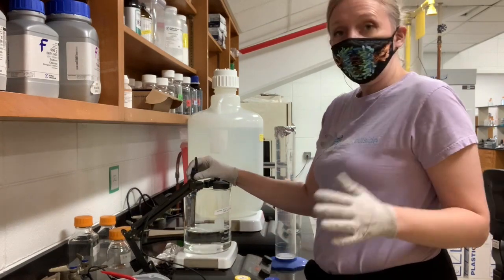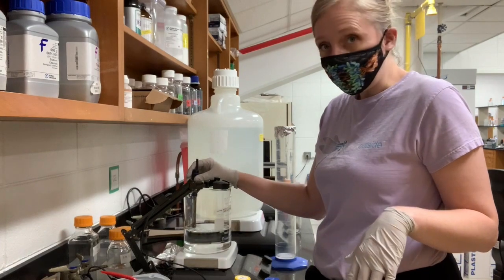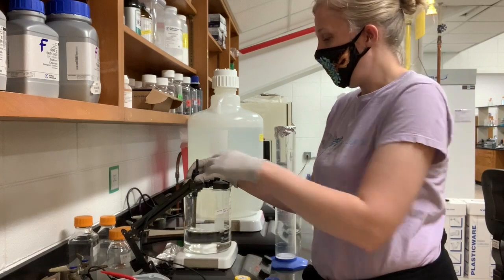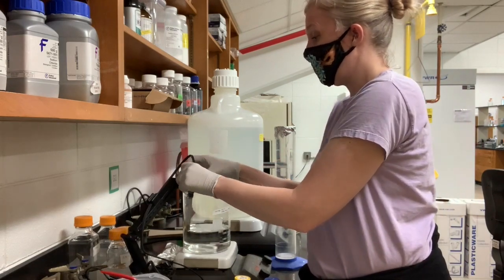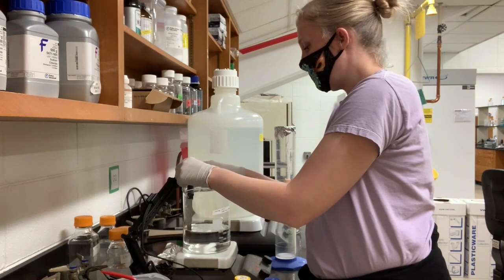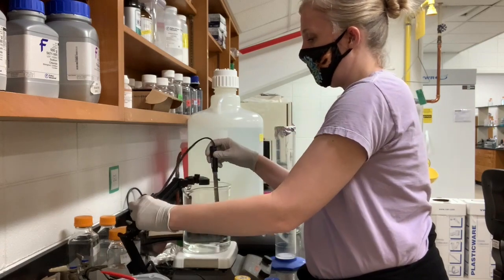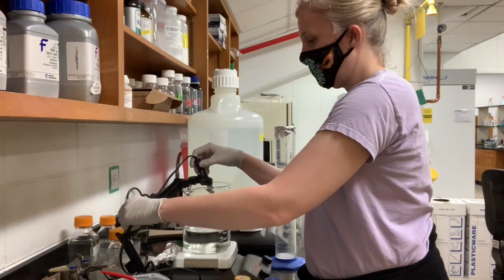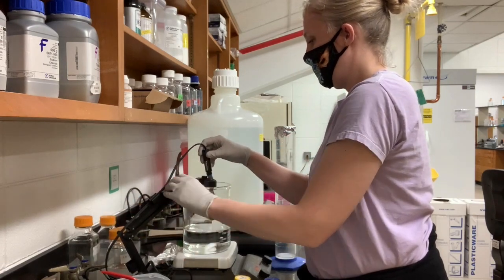You want the end of the probe to be inside the solution, that way it can measure, but you don't want that end of the probe to be anywhere near the stir bar, because you don't want this to get knocked around, right? So you'll have to maybe play around a bit to see what works for you. I'm trying to adjust the cord to kind of hold it in place.